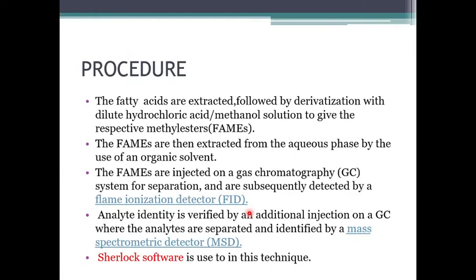So let us see the procedure of how this technique is actually performed. So first, from the cultured bacteria, the respective fatty acids are extracted and followed by the derivatization with dilute HCl and methanol to give the respective methyl esters, FAMEs. What is derivatization?